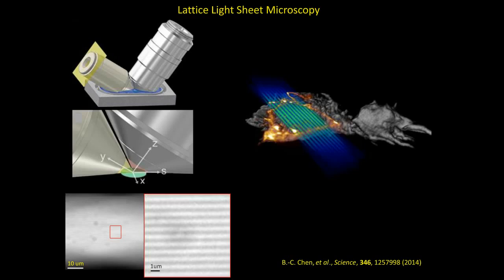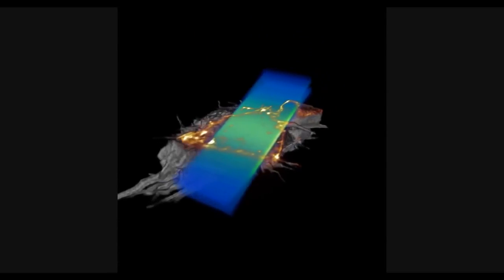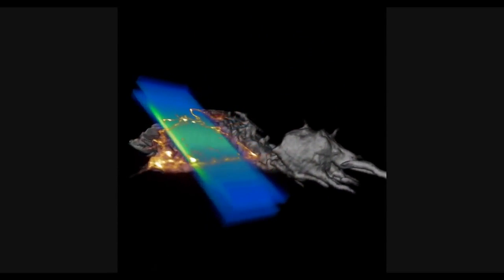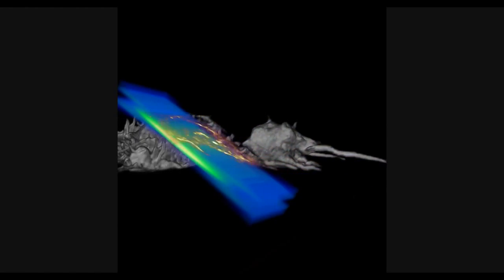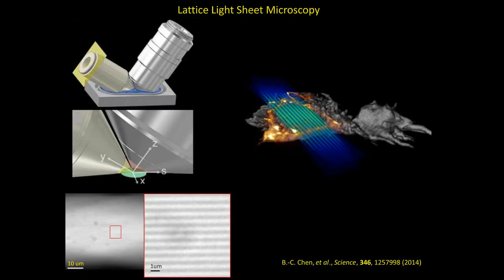So here I will show you animations of how we get 3D movie imaging by scanning.